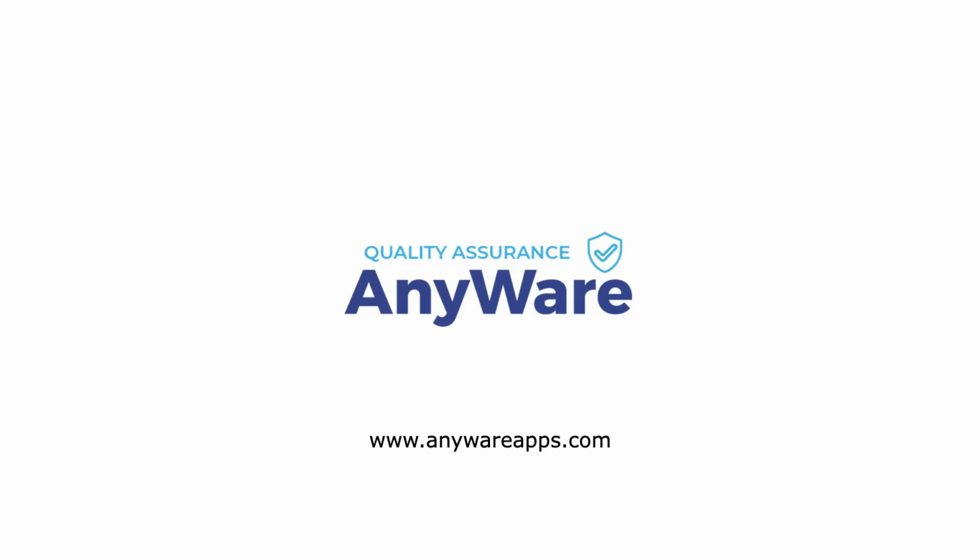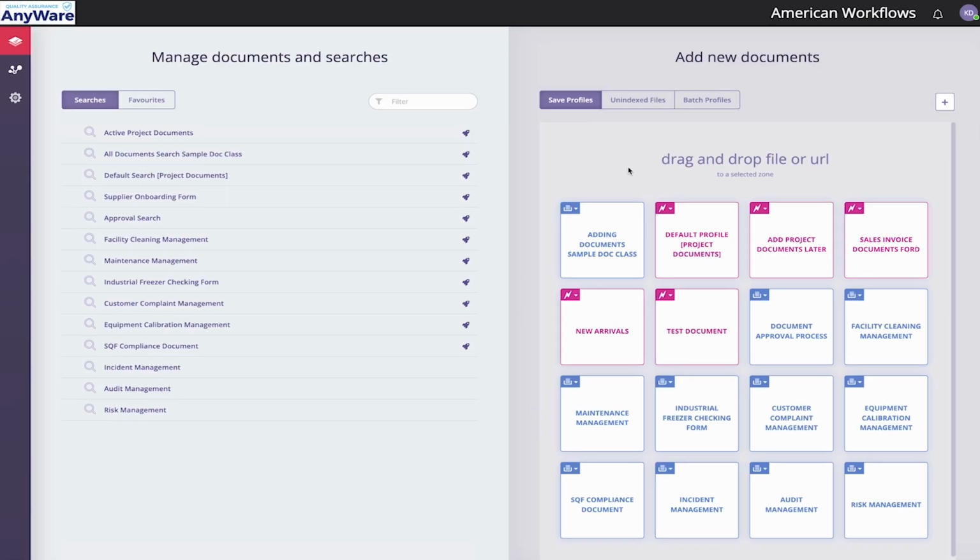Hello. Today, we are going to be talking about quality assurance anywhere, focusing on the biopharma industry. All right, so as you can see on the screen, we split it into two. On the left, we have searching for information, and on the right, we have adding information.